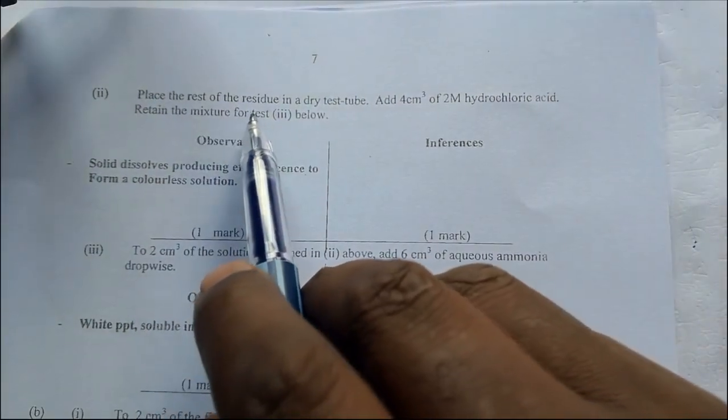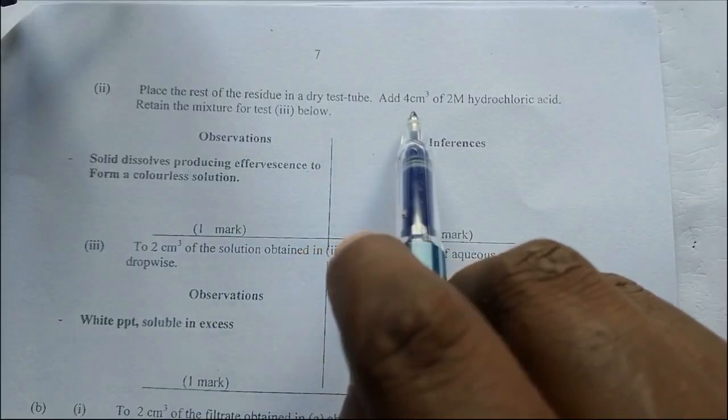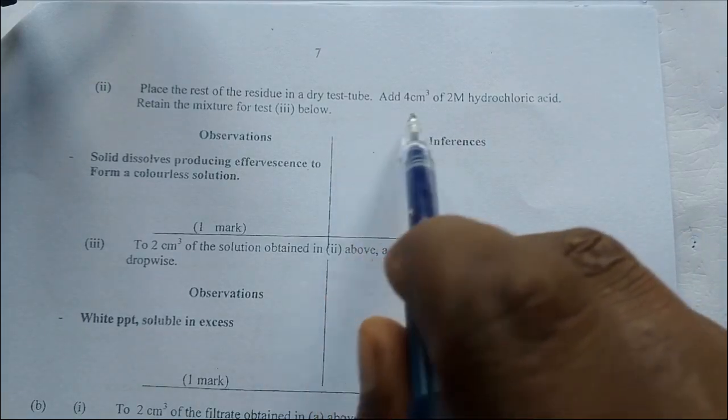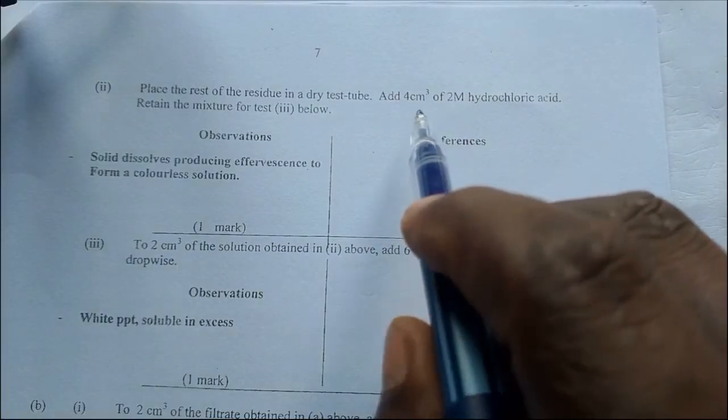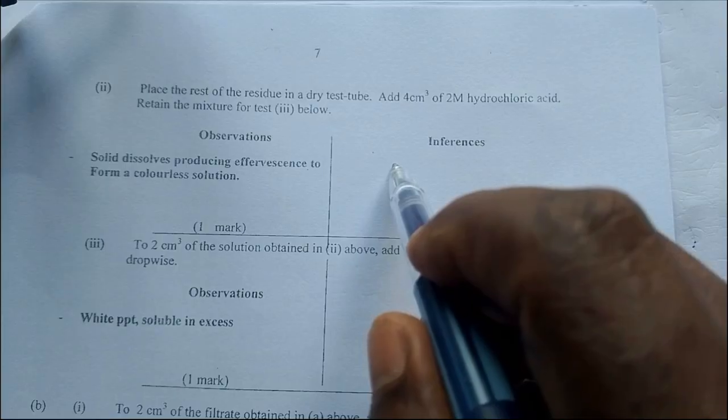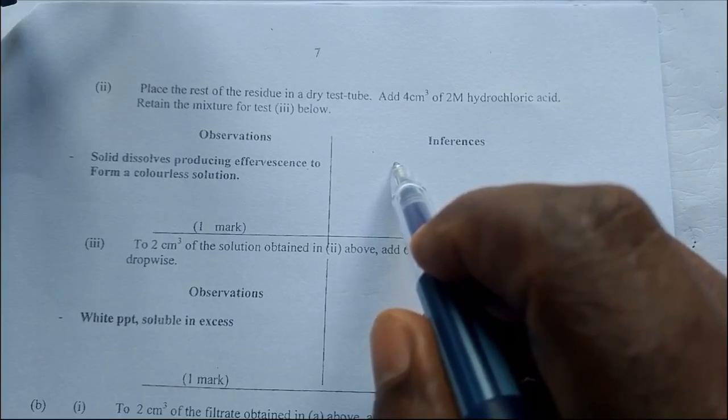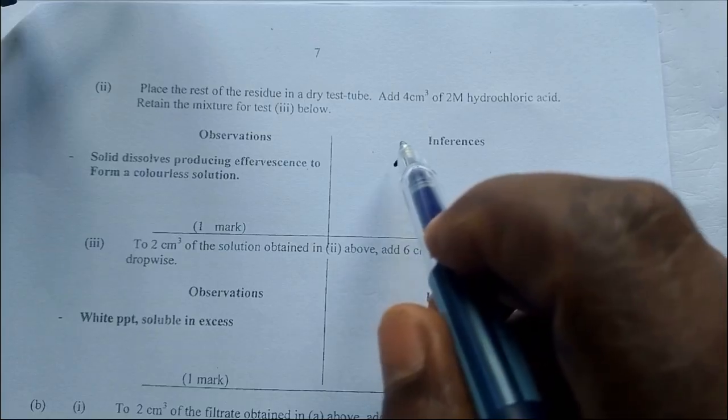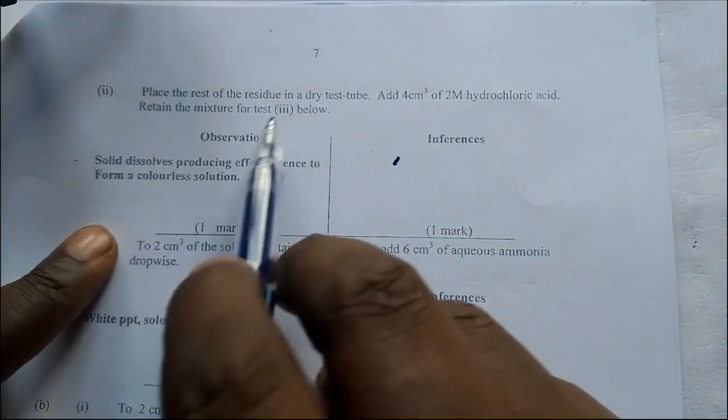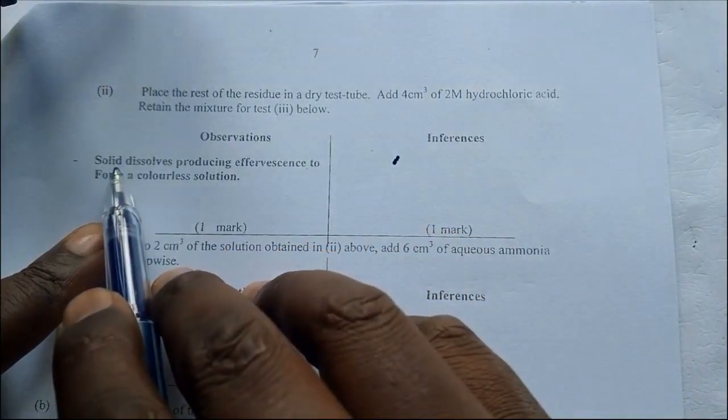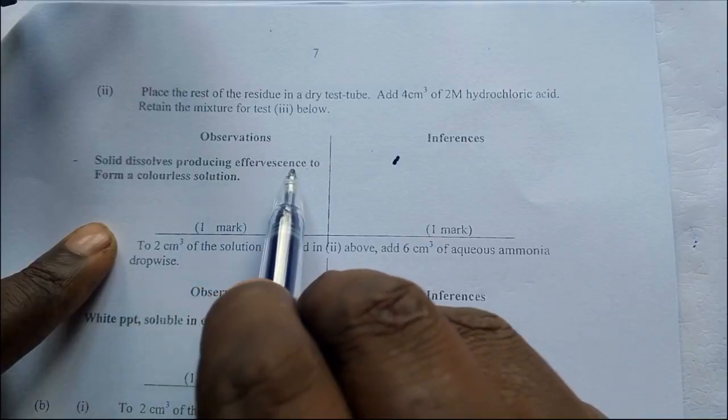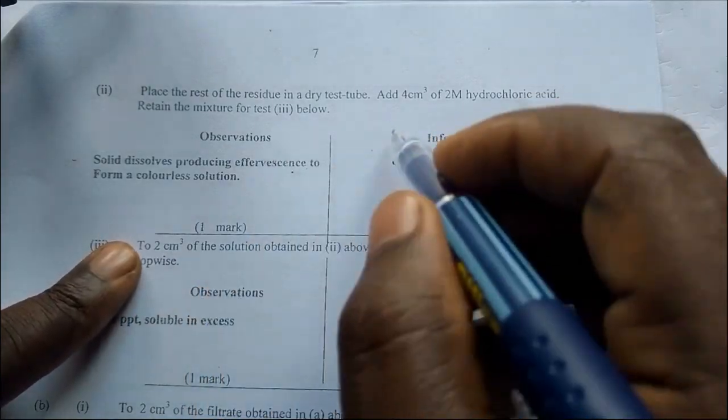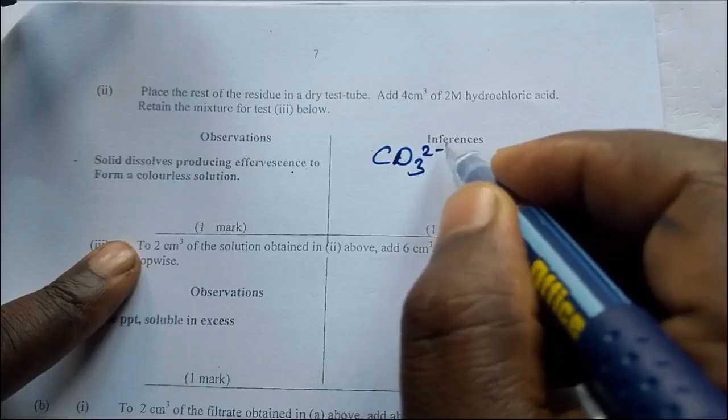Place the rest of the residue in a dry test tube. Add 4 cm³ of 2 molar hydrochloric acid. I have always told you, whenever you are adding a seed into a test tube containing a solid, one thing you expect is effervescence. So if it is, effervescence will occur or not. Therefore when the acid was added, the solid dissolves producing effervescence.